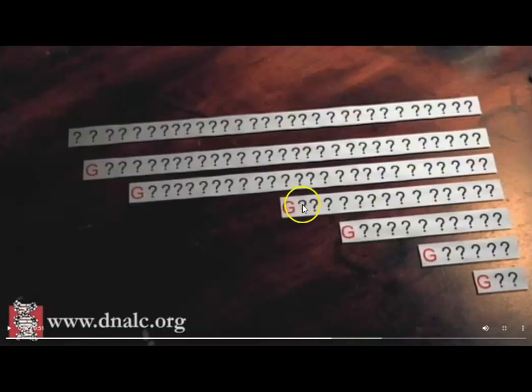So we are adding to our tubes these G's, and once they reach their positions in the replication, they stop the replication process. But we have separate and different fragments each time the G is added for replication.